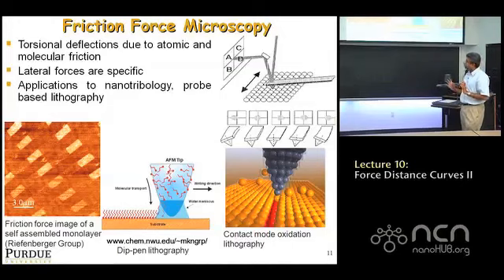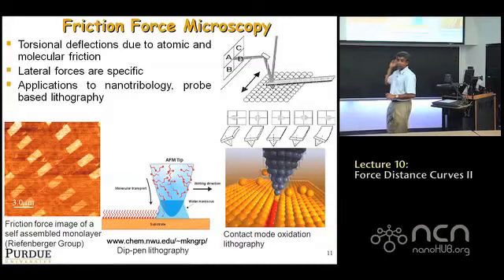So that's a quick, rapid overview. We're doing force distance curves to study fundamental forces, but ultimately you're going to use it for contact mode. When you do contact mode, you can do friction force, you can do lithography, a lot of interesting things. So the implications of understanding force-distance curves filter into all these different things, right? What set point forces would you choose for these kinds of applications?